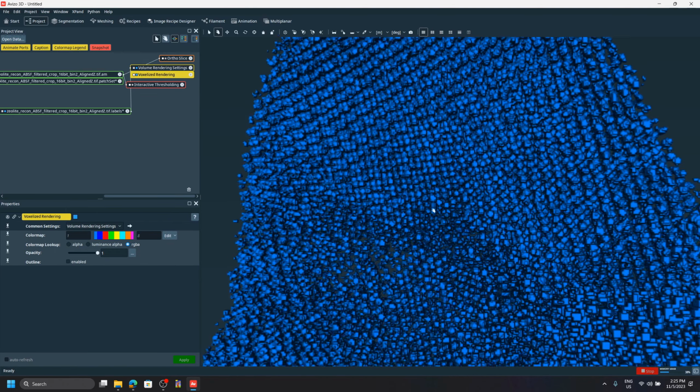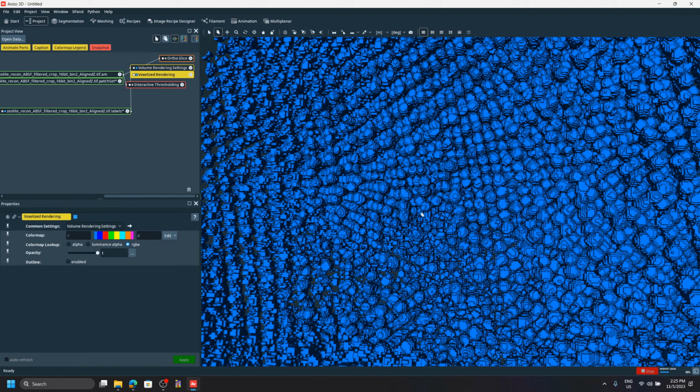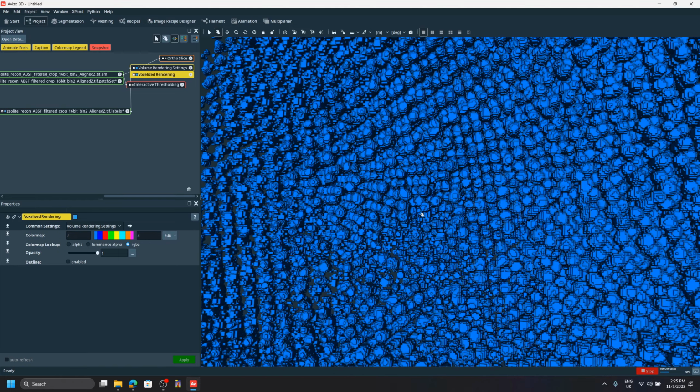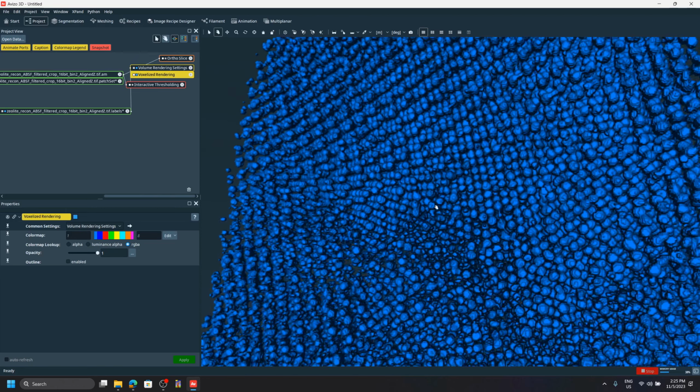You can see that it's getting these spherical shapes. That's really amazing. In the paper that they submitted, they just used thresholding, so the results weren't as good as this. But now you have that option. It was just a few minutes. Look at that. It's really getting the nice shapes, but it's not perfect.